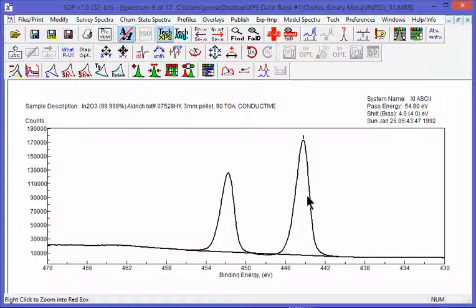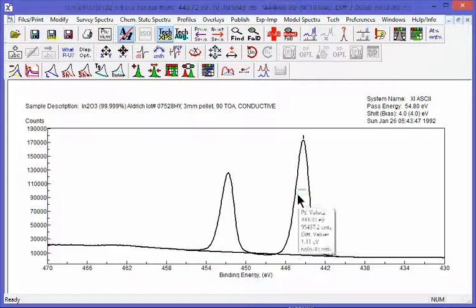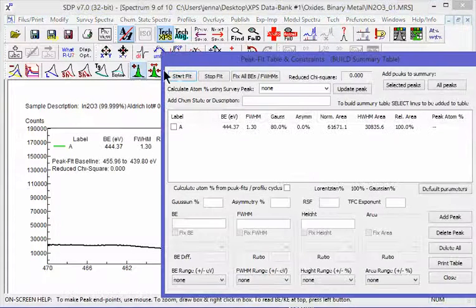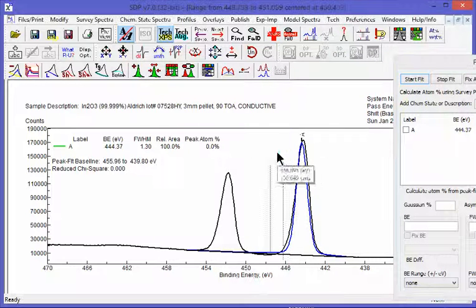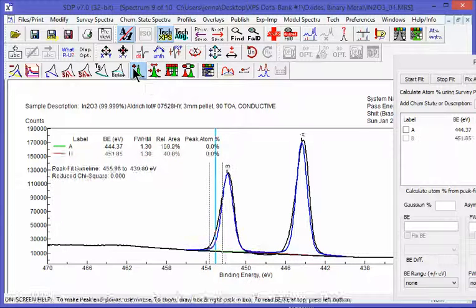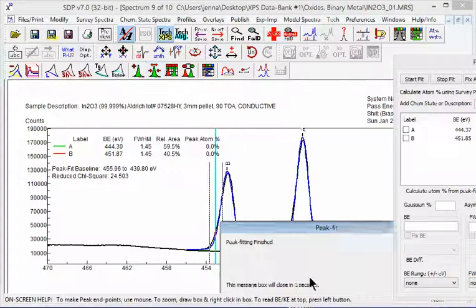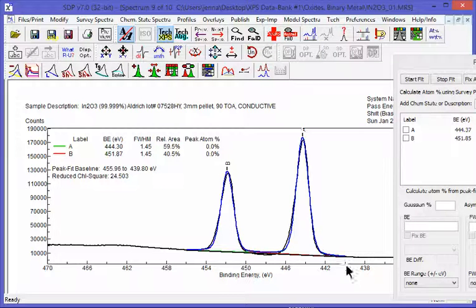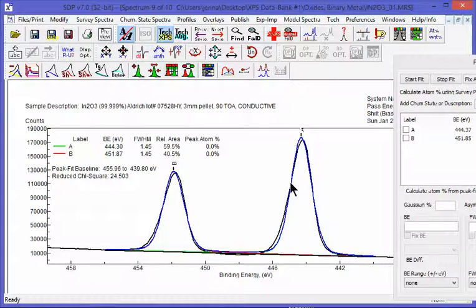So we're going to go ahead and try just individual peaks for these two peaks. Add that peak. We drag the peak generator over here, add that peak, and we hit iterate the peaks. The reduced chi-squared comes out quite large, and if you look in here at the shapes, it's not necessarily such a good fit.